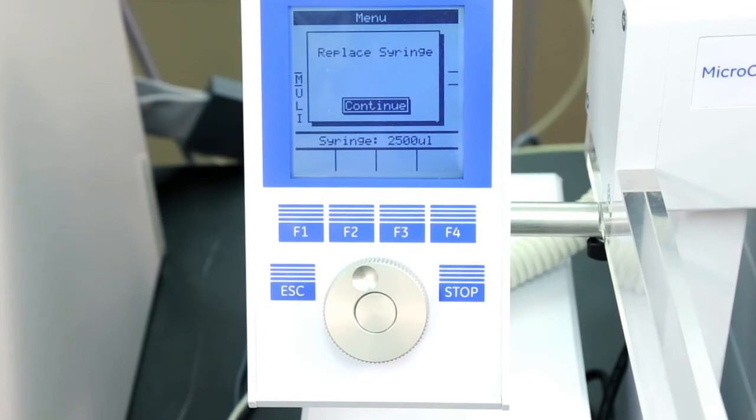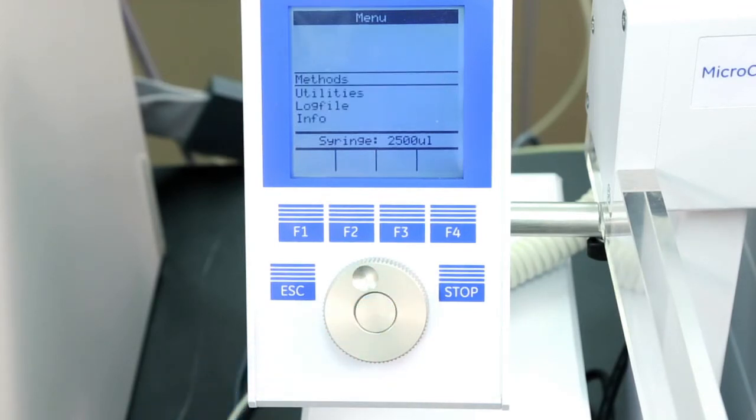After the syringe has been inserted, press the enter button on the console and then press the home button. The plunger will then move down until it hits the mechanical stop. This position is stored as the syringe's zero volume position and then the injection unit returns to its home position.